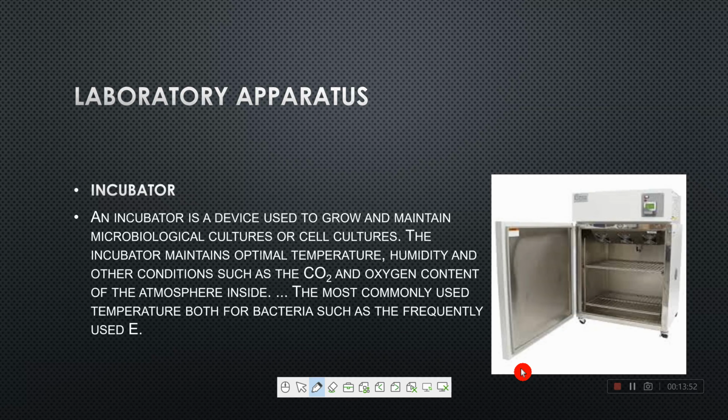Next one is the incubator. So an incubator is a device which is used to grow and maintain microbiological cultures or cell cultures. As the name implies, incubator. So it is used to incubate the culture media, or the media which is used for growing bacteria, providing a specific set of temperature, humidity and other conditions. Alright, so it is most commonly used as a temperature incubator for the frequently used bacteria.